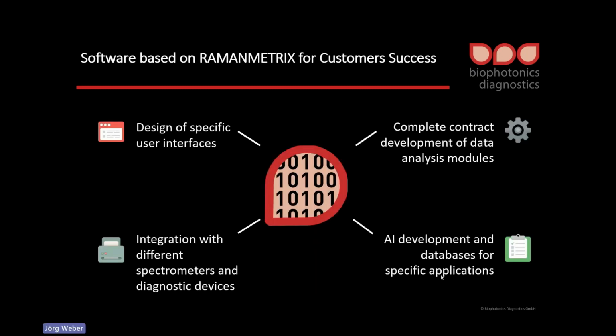And especially for the RAMANMETRIX, there's one software package now, but if there are needs to design specific user interfaces or integration in different spectrometer software or diagnostic devices, and also special databases or specific application algorithms, then we can support you, so that you get the best out of your Raman spectra.